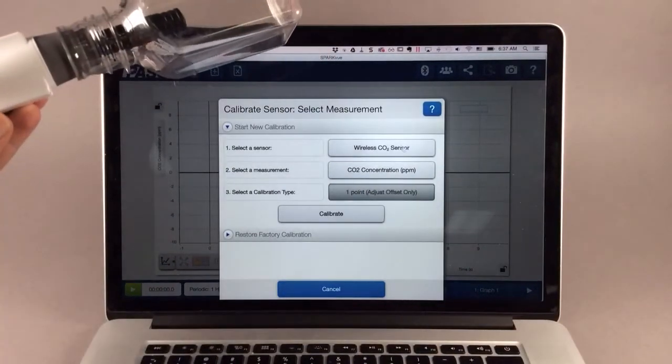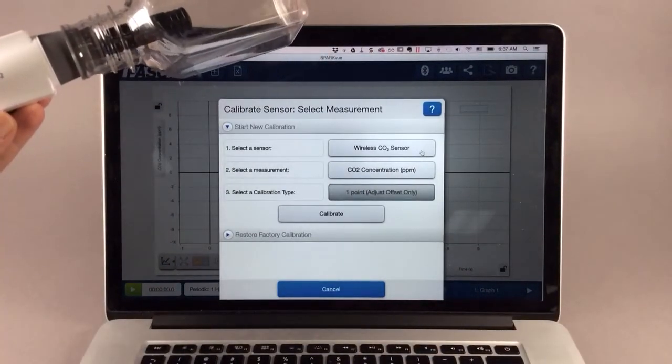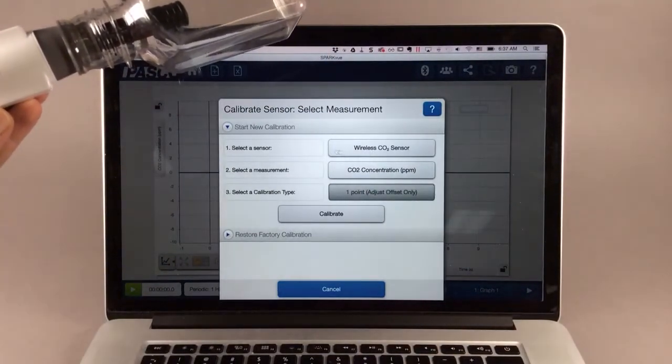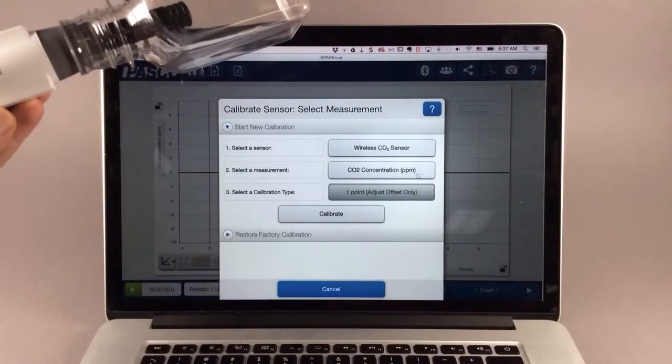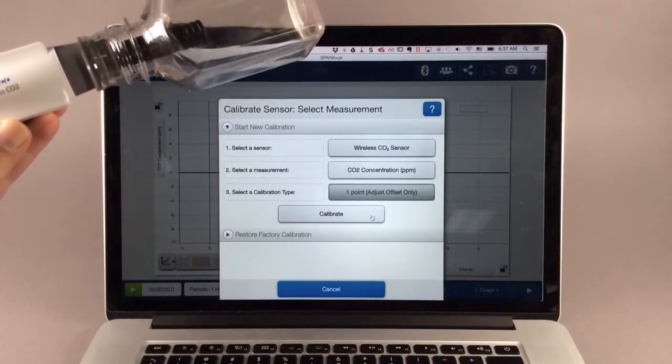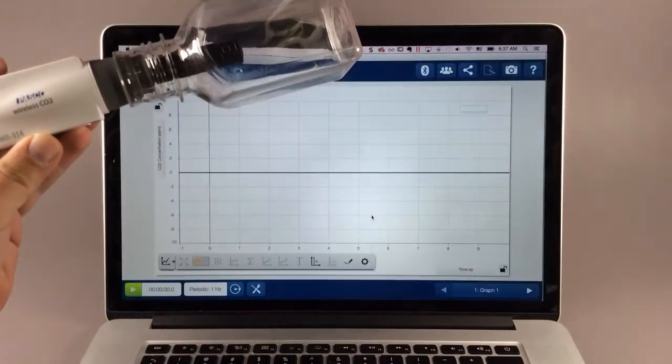Make sure that you have the wireless CO2 sensor selected and the CO2 measurement, and then select Calibrate.